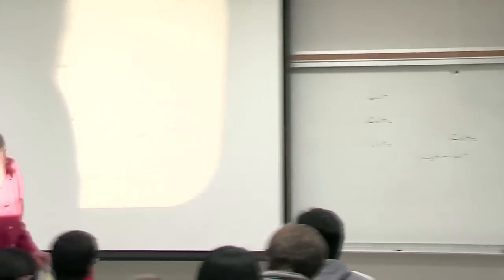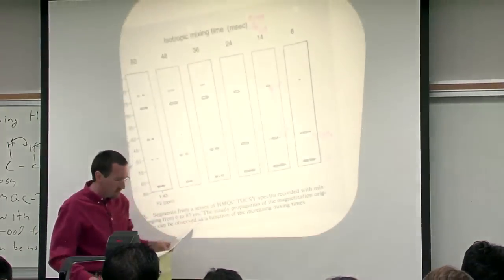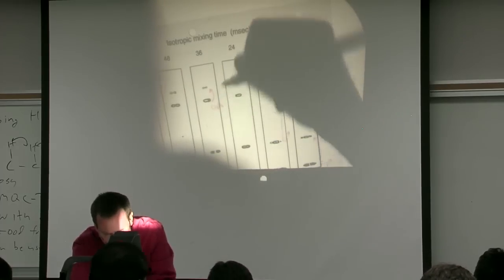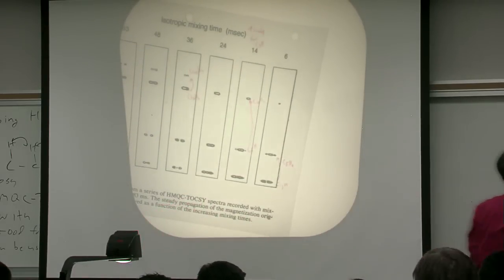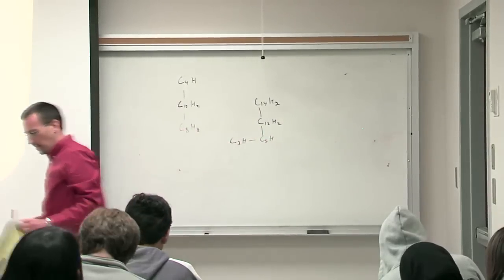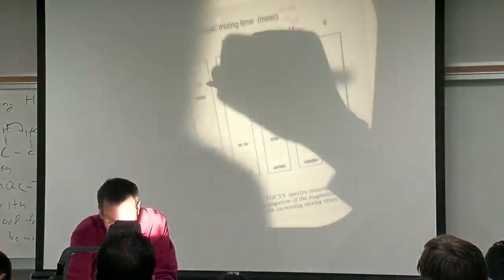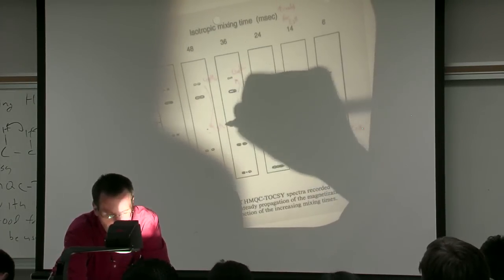All right. At 24 milliseconds, the C12H2 cross peak is well developed. And by the time we're coming up to 36 milliseconds, we're getting a new cross peak. So now, all on the C3 track, we're hopping from C12H2 up to C14H2. So we are literally building up this chain in the crowded region of our bromomalleol isomer. And now, as he continues up to 48 milliseconds, now we see a new peak developing that's actually developing rather well by the next one. So we're going from C14H2 up to C7H2.